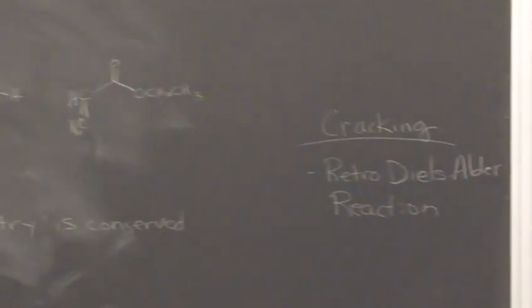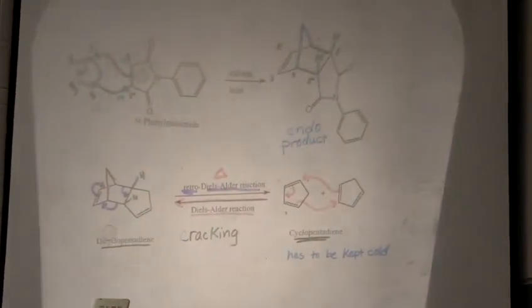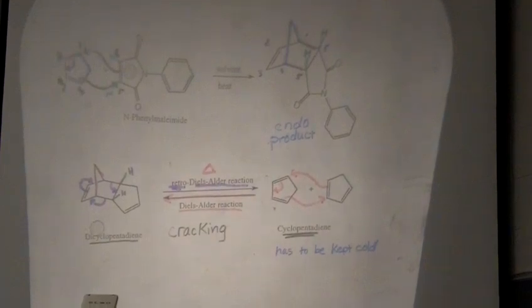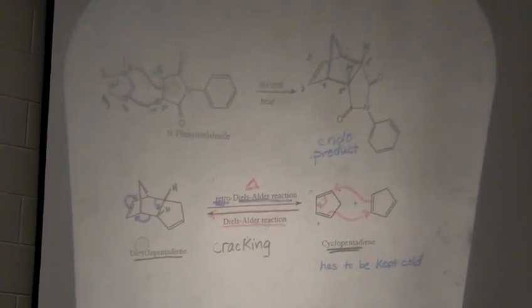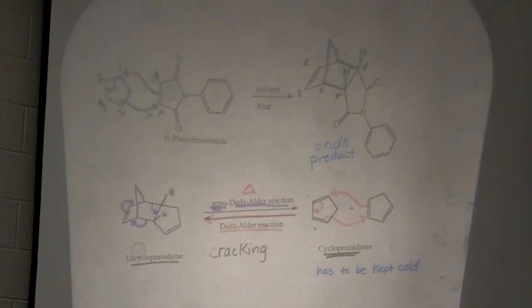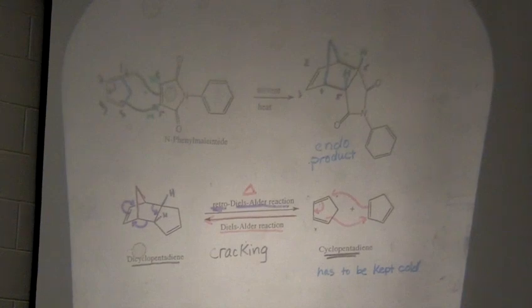So this week in lab, before you start the lab, it doesn't stick around really well as cyclopentadiene. It has to happen right before you start the lab. So this week in lab, right before the 7:30 labs and right before the 1 o'clock labs, I'm cracking the cyclopentadiene, and you're going to get this from your lab prof, okay?